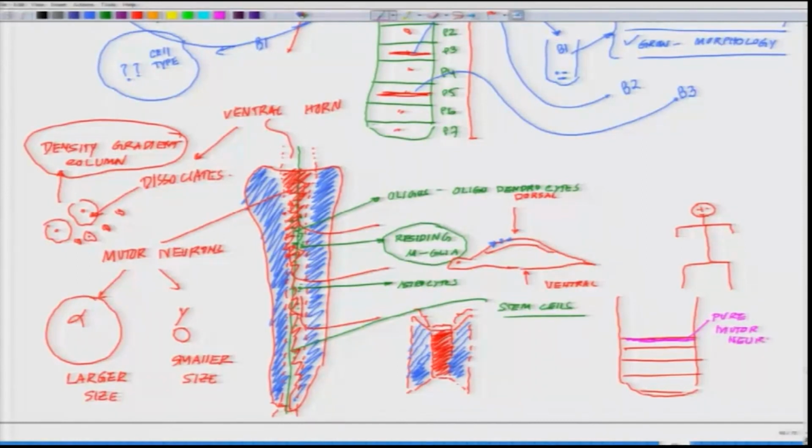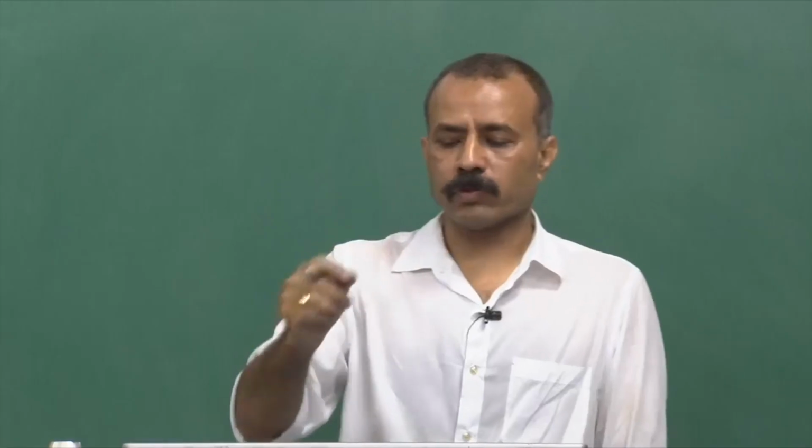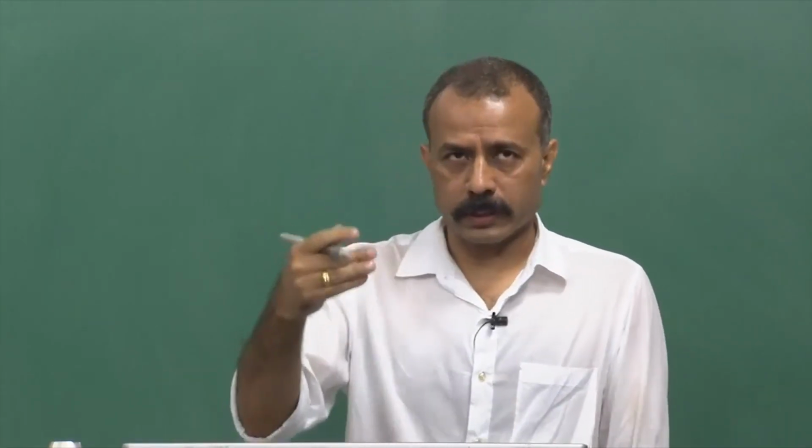And if I remember it right, this was done with sucrose as well as with Nycodenz. And there are specific devices which are used to measure the density. I will give you those papers, you can check out what kind of devices are used to make these density gradient columns.